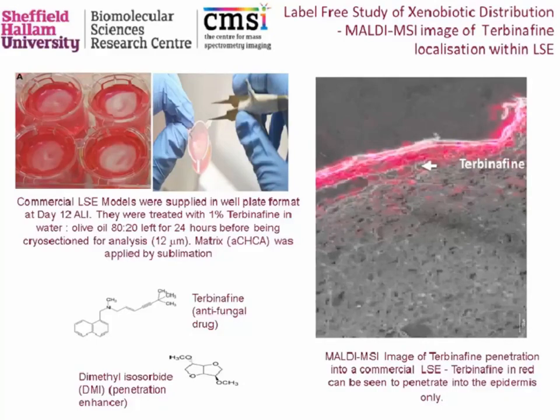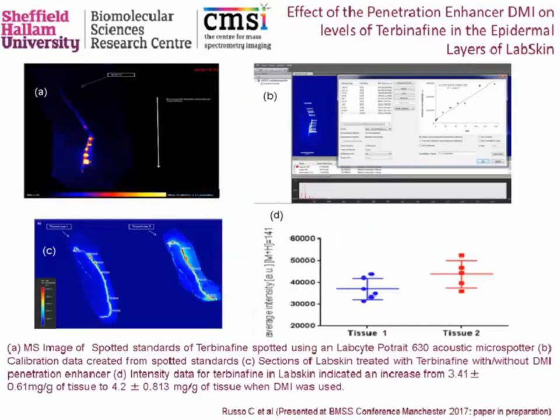So in the initial mass spec image here, we can see a vertical section through the skin that's been treated with terbinafine formulation and then sectioned after 24 hours. And you can see that this is a compound that's designed for topical use. It's designed to treat fungal infections of the skin. And as you might expect here, you can see that the actual compound is sitting in the epidermis with little or no penetration down into the dermis. So then what we want to do is compare the formulation with and without the presence of the penetration enhancer.